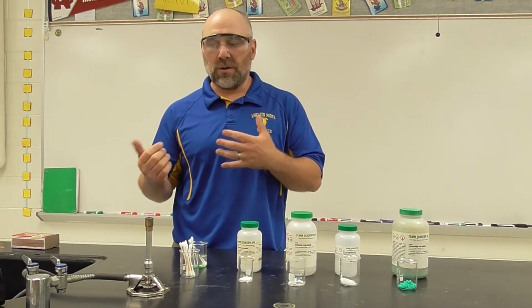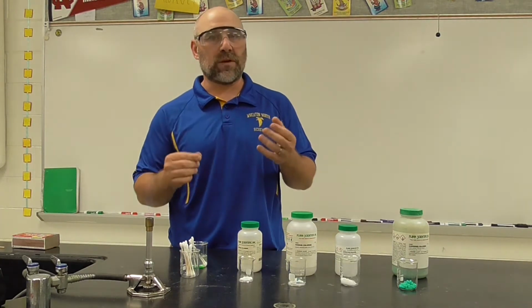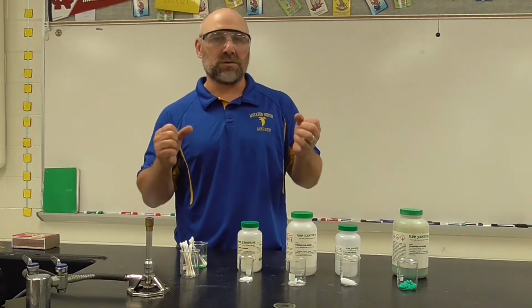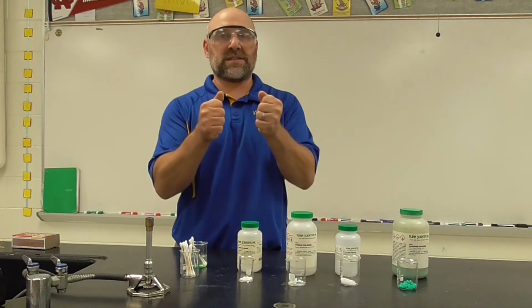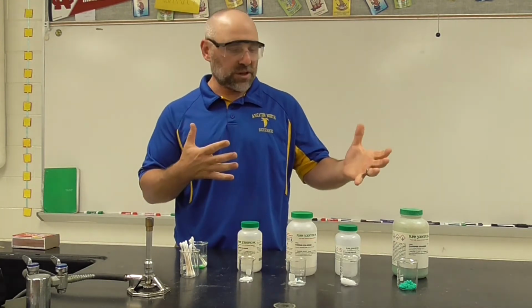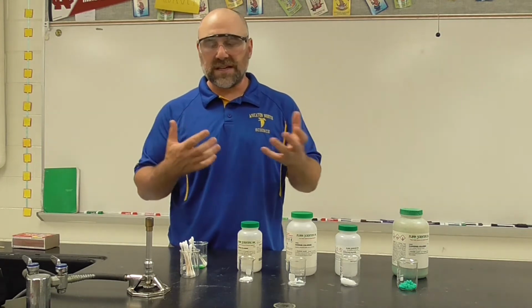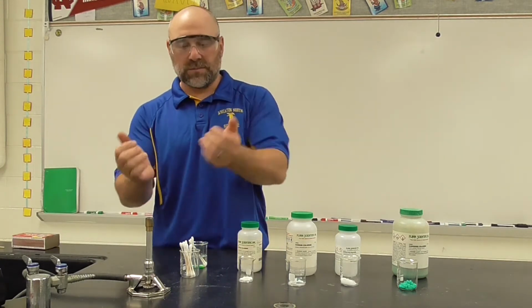Today what I'm going to show you is another example of the atomic emission spectrum. In a previous video I showed you this using gas tubes, where we took a gas tube and energized it with electricity and showed you the various spectrums that they would produce as those electrons in the atoms jump to an excited state and then release photons as they return to the ground state. Today I'm going to show you a similar concept, but instead of using electricity as my energy source, I'm going to be using a flame, a Bunsen burner flame.